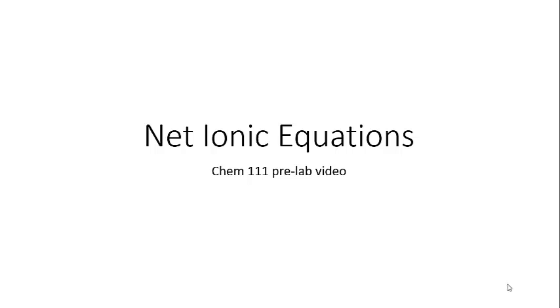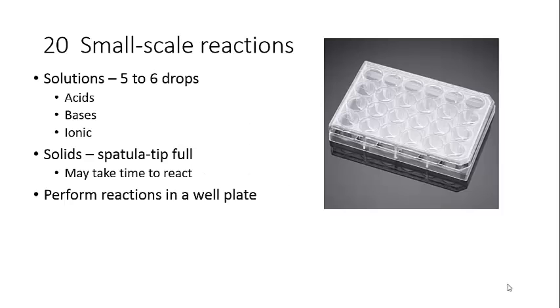The next lab for Chem 111 is called Net Ionic Equations, and this is our pre-lab video. We're going to be performing 20 different small-scale reactions, and it's a really fun lab. I think you're going to enjoy this.